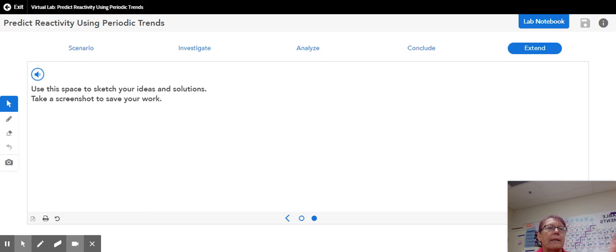Okay, so that's kind of a walkthrough of the lab that you guys are going to do. We're going to start it today in class, but I did just want to give that to you. So if you're not sure when you get back to start it on your own, you can then have something to refer to.